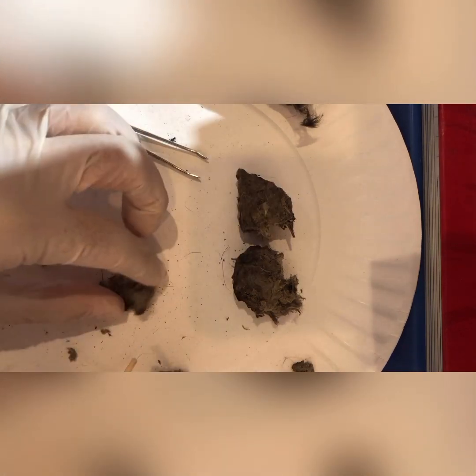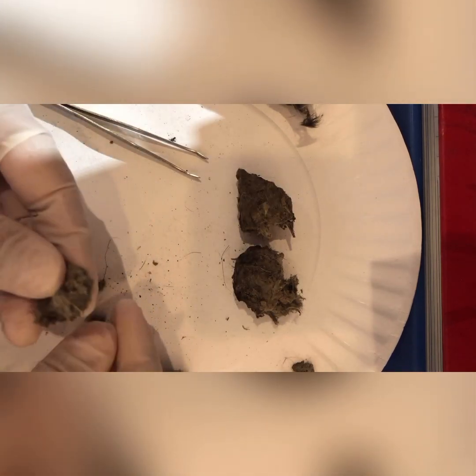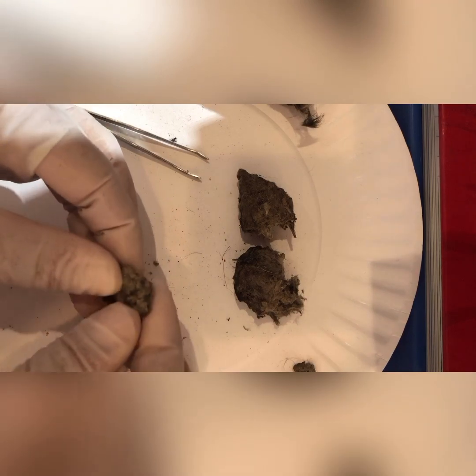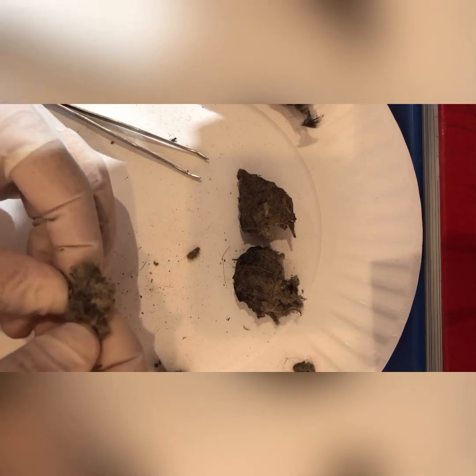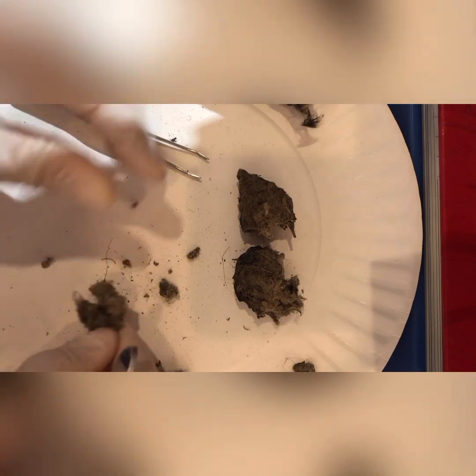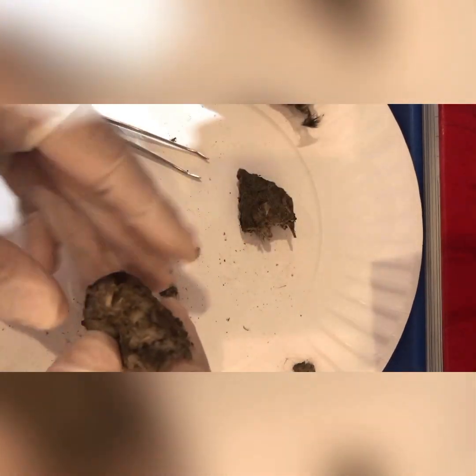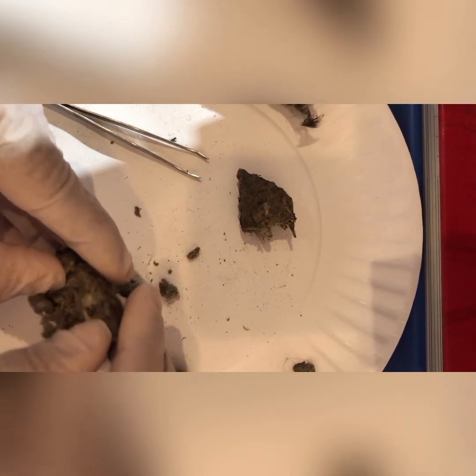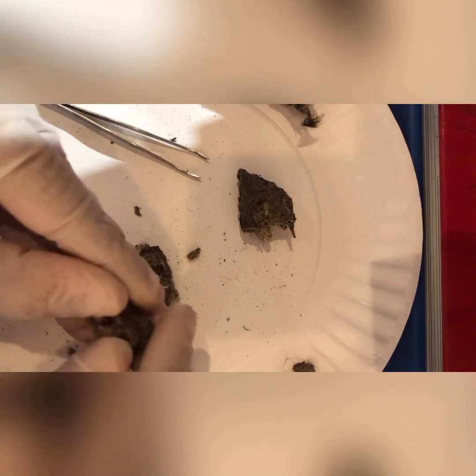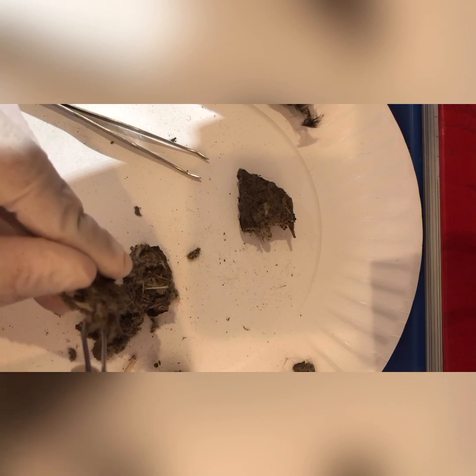This was some kind of a smaller animal, probably a vole or a very, very small mouse. This was probably not a rat. The one thing that's really going to help me identify what was inside is the skull, the beak, the jaw that I find. I don't see anything exciting just yet, so I'm going to go into the other sections and see if I can find any other bones.